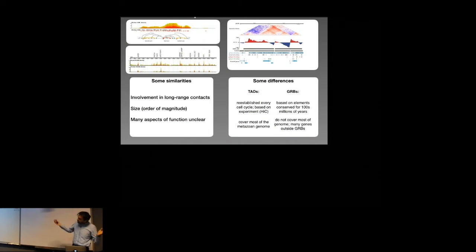So one thing is actually, since those genomic clusters are clusters of enhancers which are supposed to somehow interact with their target gene, we wanted to see what the relationship is within those regions and topologically associated domains derived from Hi-C data or 4C data for individual loci.